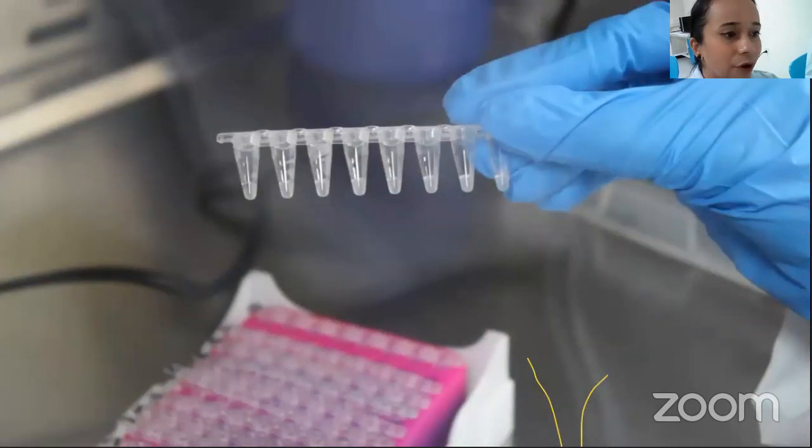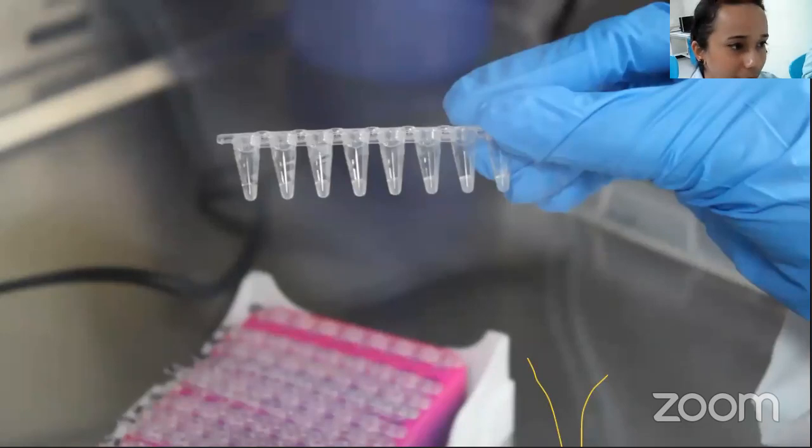You should check for the volume in each well. It should be equal. It should be 20 microliters because you have added 12 microliters of master mix and 8 microliters of RNA. That means your whole volume should be 20 microliters. So you have to be careful that it is 20 microliters.